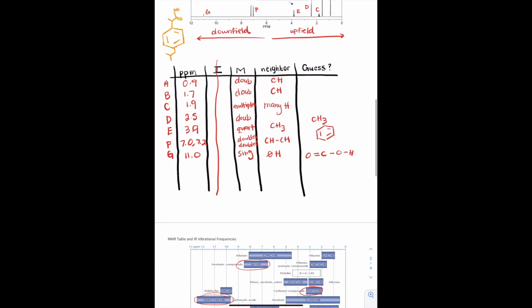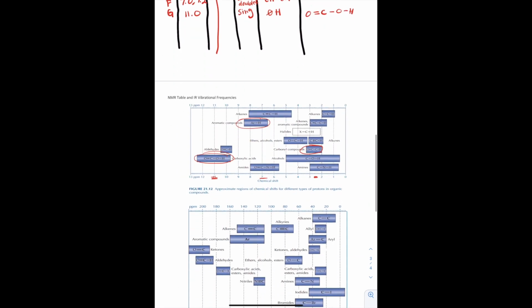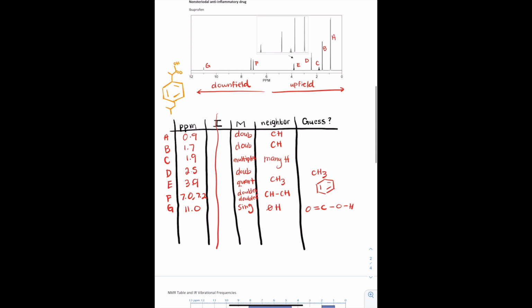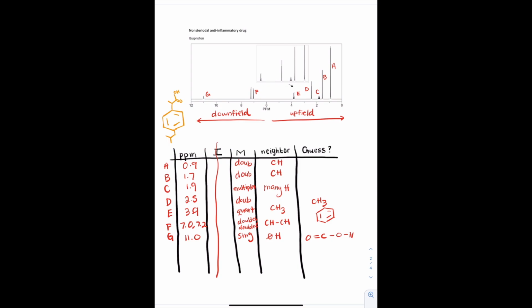And then we can also see 2 peaks, or 2 signals, signal C and signal B at 1.9 and 1.7. And if we come on over here, we're going to see again, an alkene, an aromatic compound, which is present. And for this 0.9, remember what I said earlier in that there will be more protons attached to each other the further upfield the peak is.